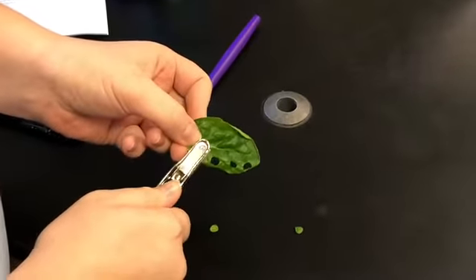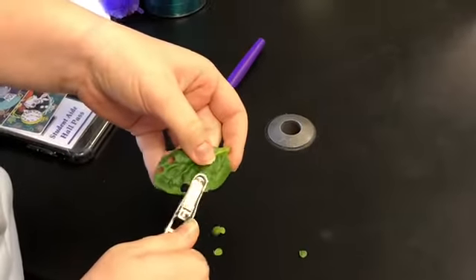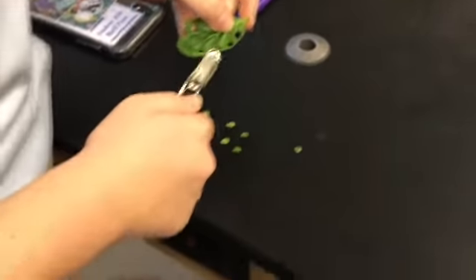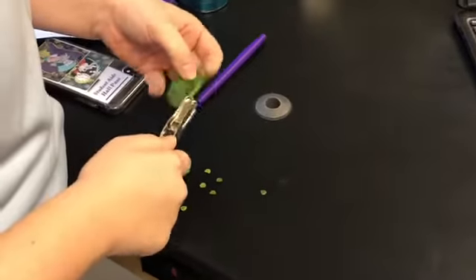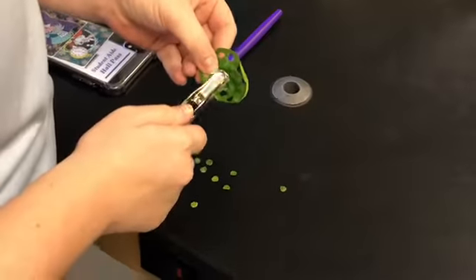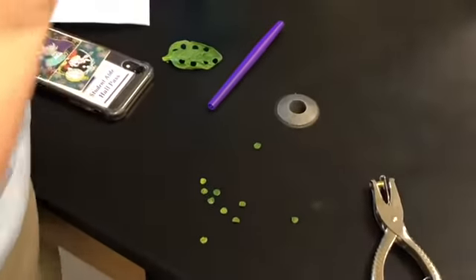Variables. The independent variable in this lab was the light source and the color of that light source. We were changing the light source and the color in order to test if the color of light sources will affect the rate of photosynthesis. In this lab, we first tested the effect of regular sunlight on living leaves. Then we tested the effects of pink light on the living leaves.